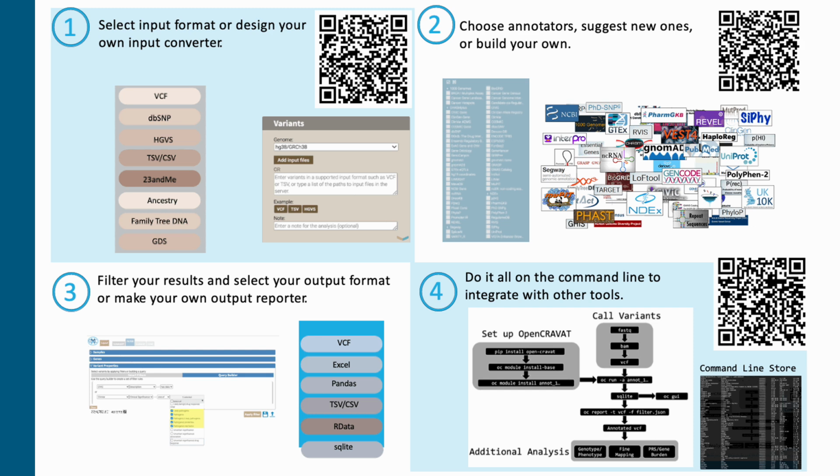So on this slide, you can see here that I've built a simple filter. I would here like to see variants that have some kind of data associated with them in CIVIC, a clinical annotation database, and I would also like variants that are annotated as likely pathogenic, pathogenic or likely pathogenic, a risk factor, and so forth in the ClinVar database. And I did this with a drop-down menu and a checklist.